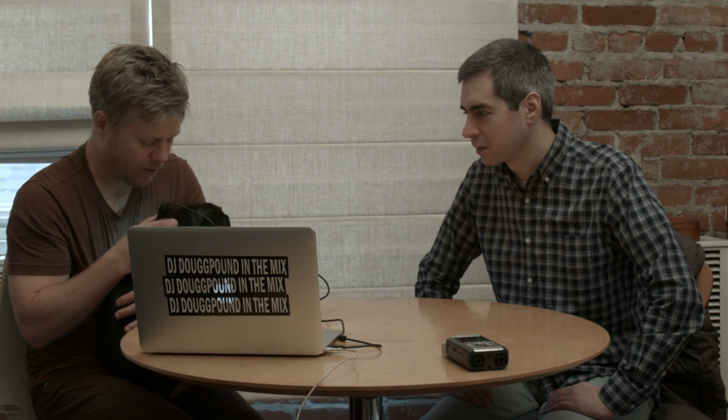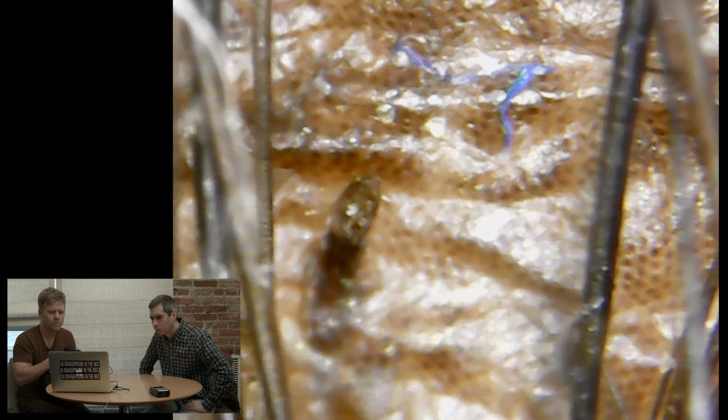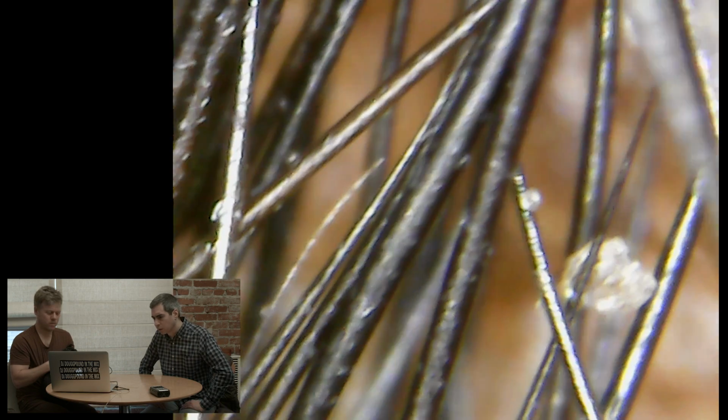She has a scar right here, actually, where she got attacked by a coyote. Get it in focus here. Whoa. That's what her skin looks like. Wait, is that the skin or is that the scar? This is the scarred area of her skin. Wow, there are some flakes in there. Look at that part of her skin there.